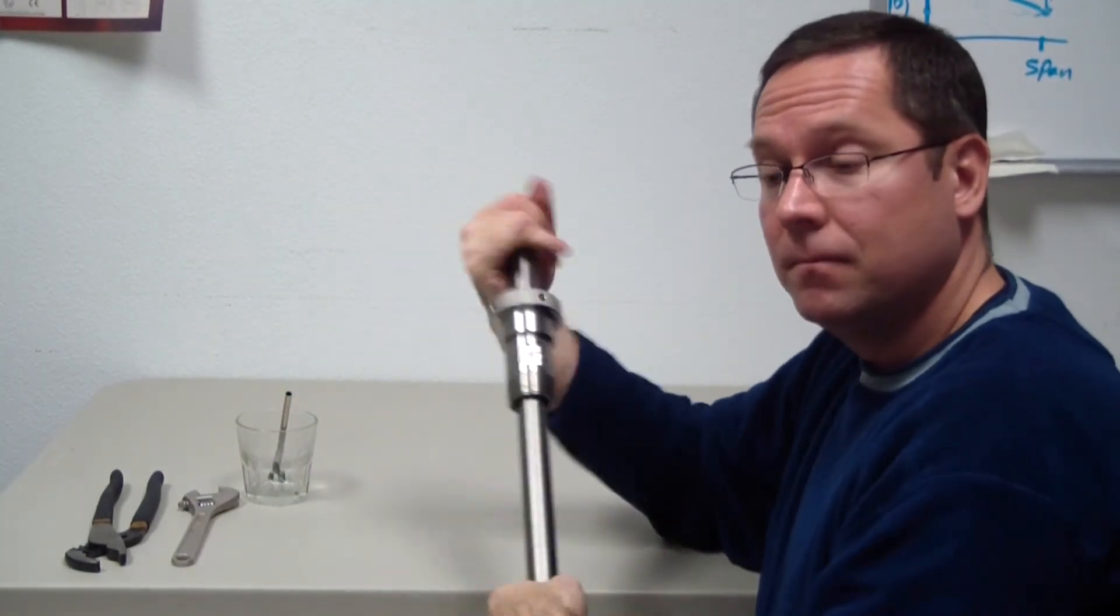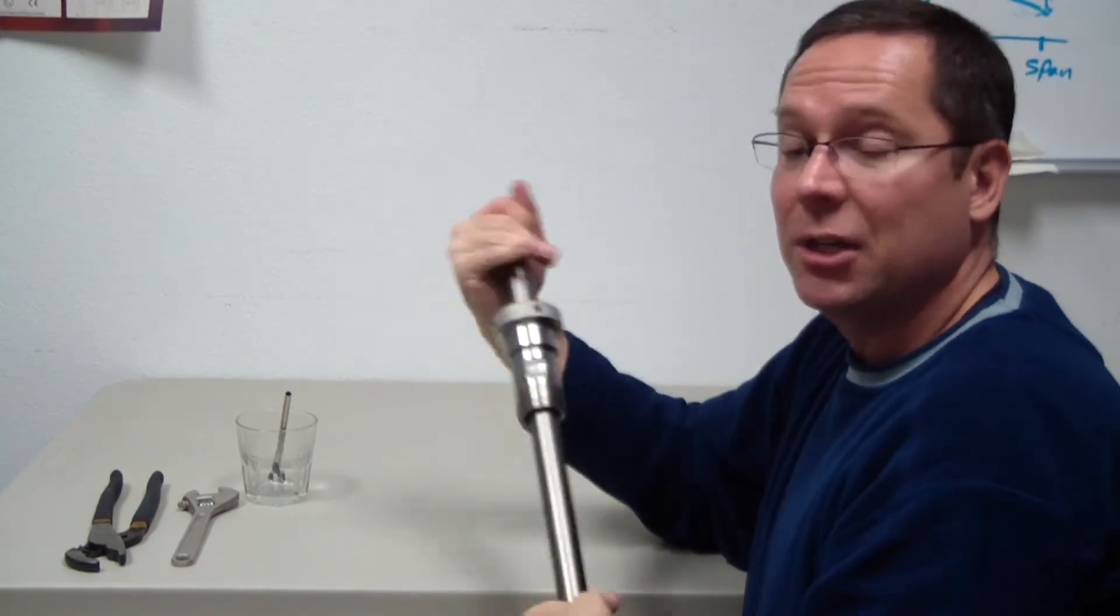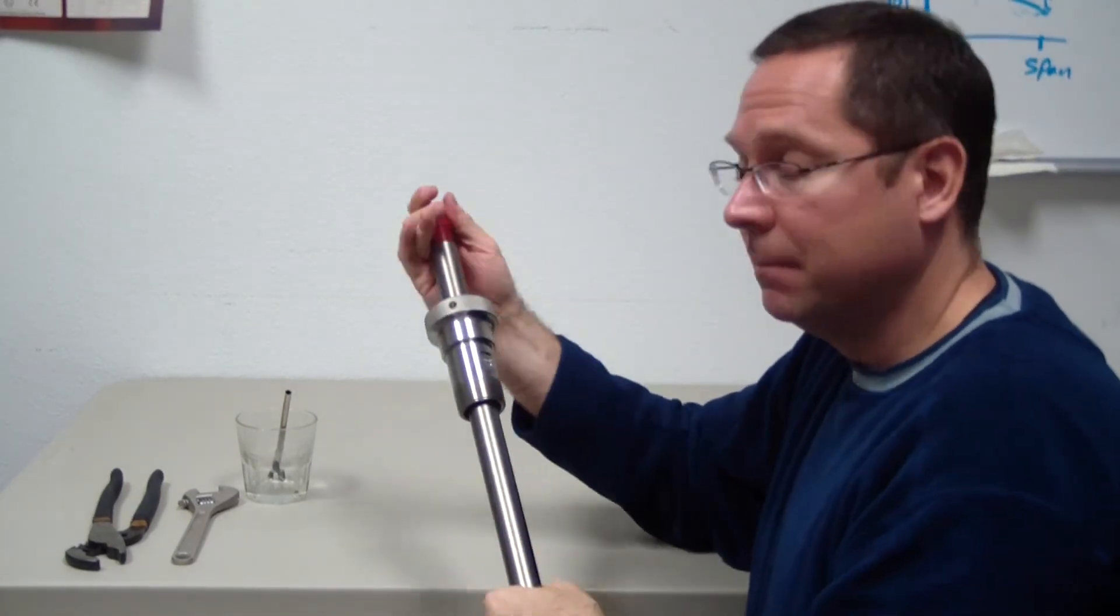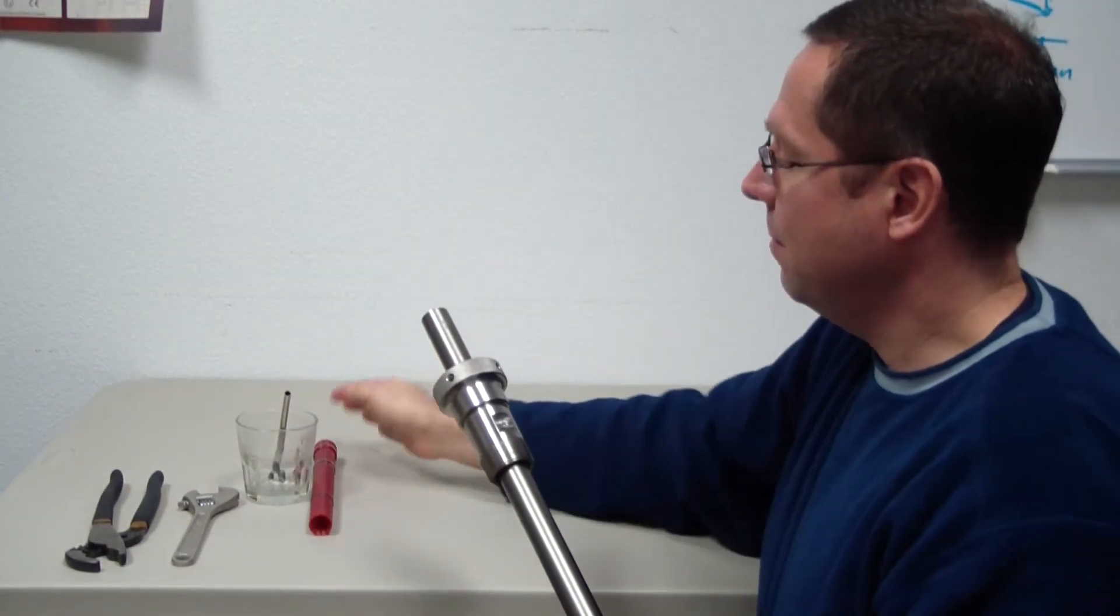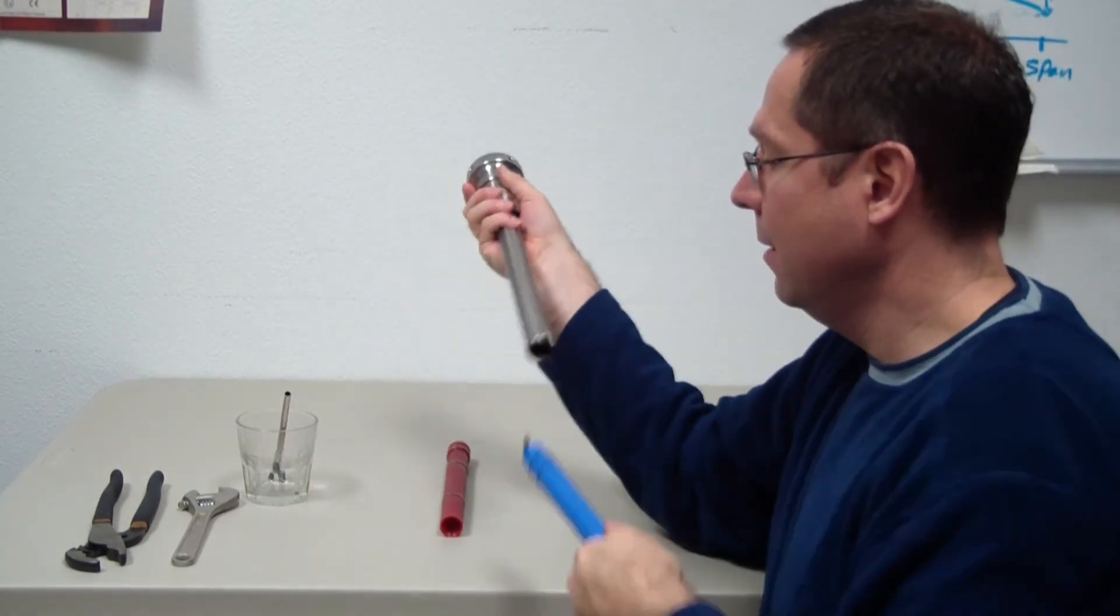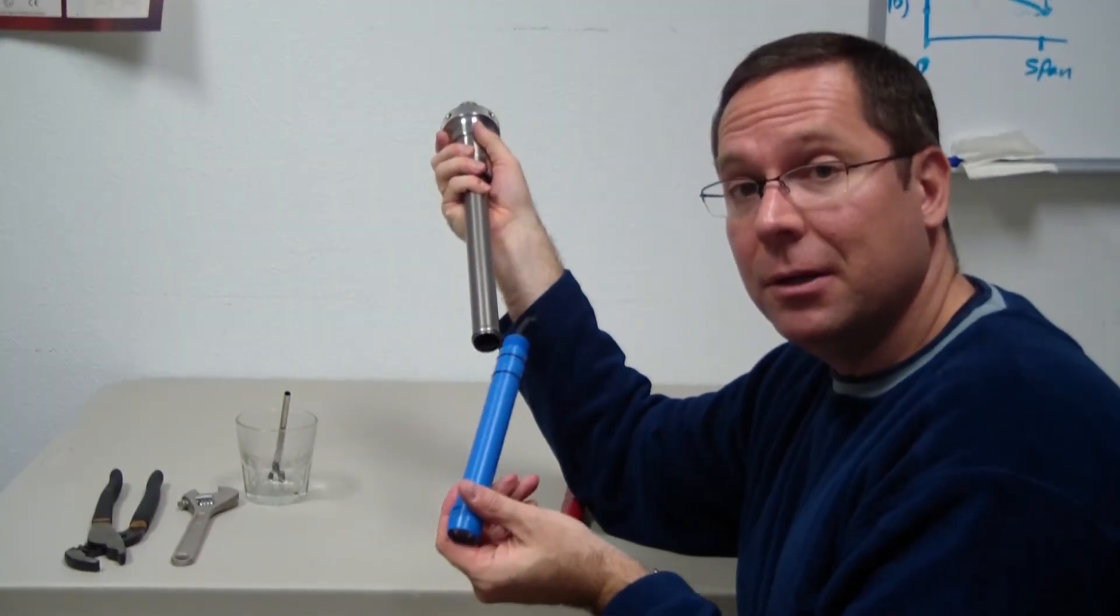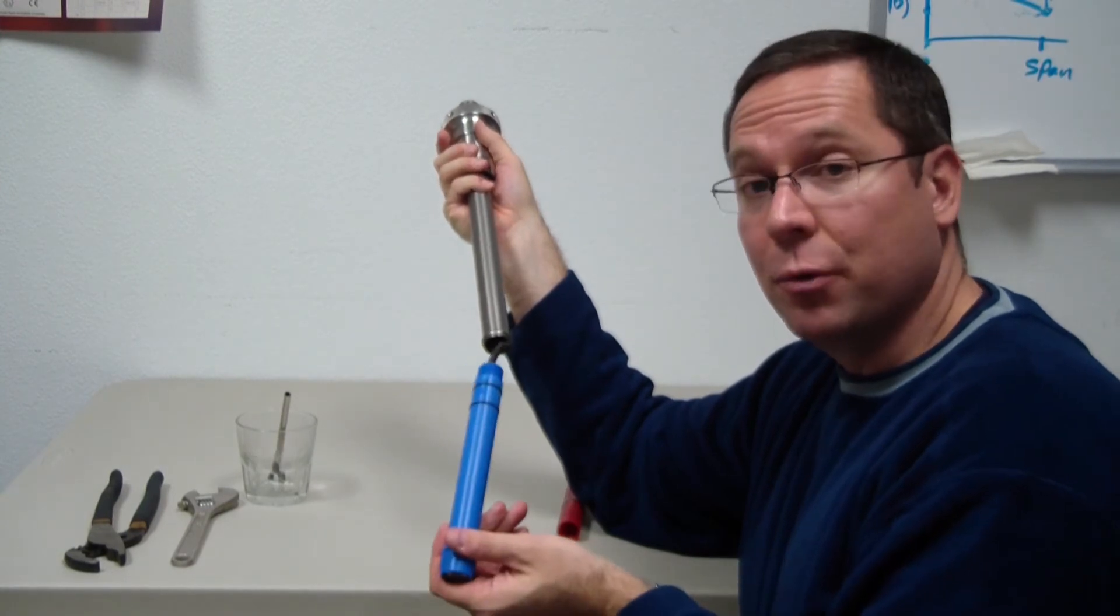Once I have things loosened up, disassembly goes the exact opposite way. Now my sensor's out for cleaning, calibration, or eventual replacement.